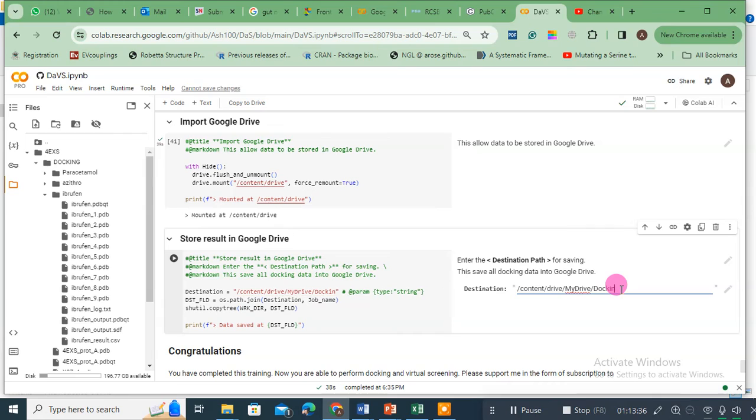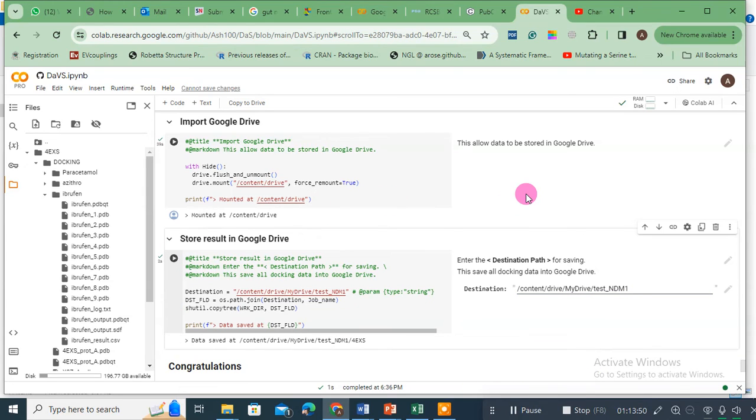I will name it like test underscore NDM1, sorry, NDM1. Okay, and click here. Congratulations, we are done. But just hold on 2 minutes more.